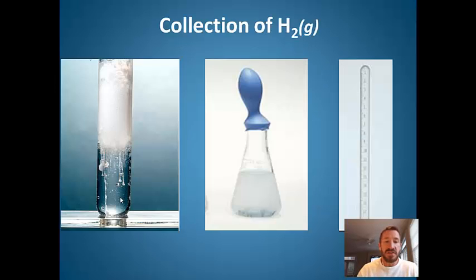Now, in the past, if we drop magnesium in hydrochloric acid, which is happening right here, you all of a sudden see bubbles. And this happens with other metals as well. For example, if you drop zinc in hydrochloric acid, you'll produce hydrogen gas. But we did a reaction similar to this if you think back when we did the lab on stoichiometry. Now, we looked at the amount of hydrogen gas that was in this balloon. We actually did that more qualitatively, like we were trying to qualitatively determine what was the limiting reactant by how much gas was collected in the balloon.